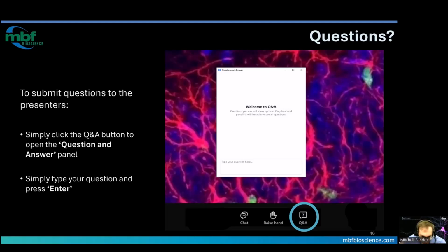I see a question. Are there changes in hardware support? Is it possible to potentially use other FPGAs, etc.? How separate are waveform control in resonant mode and the digitization part? I don't know if I'll cover all this question, but there essentially are not changes to our hardware support.